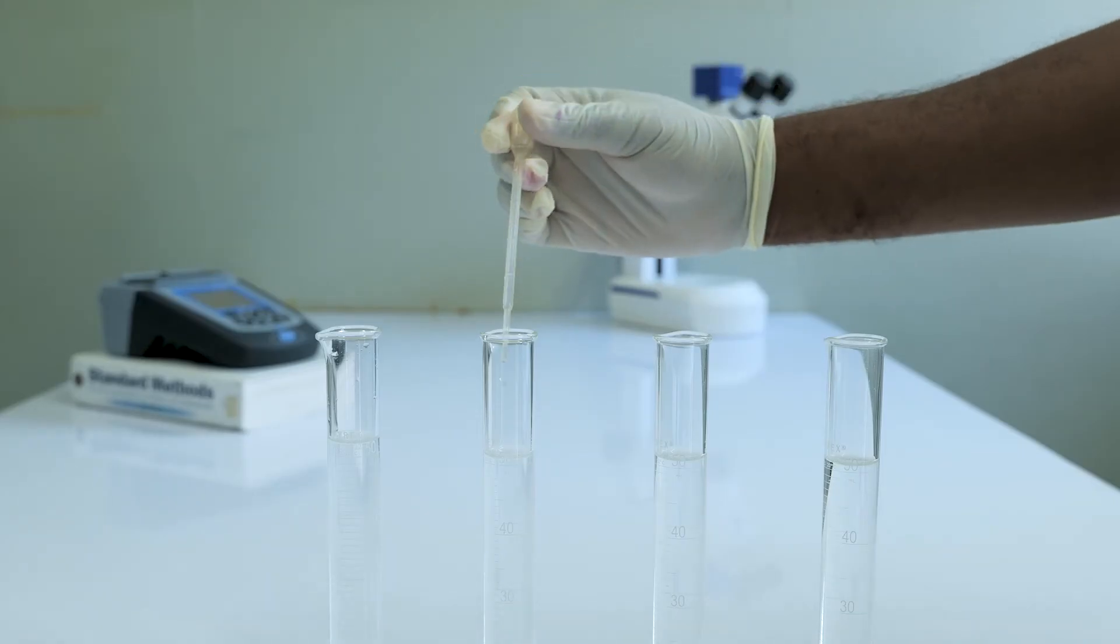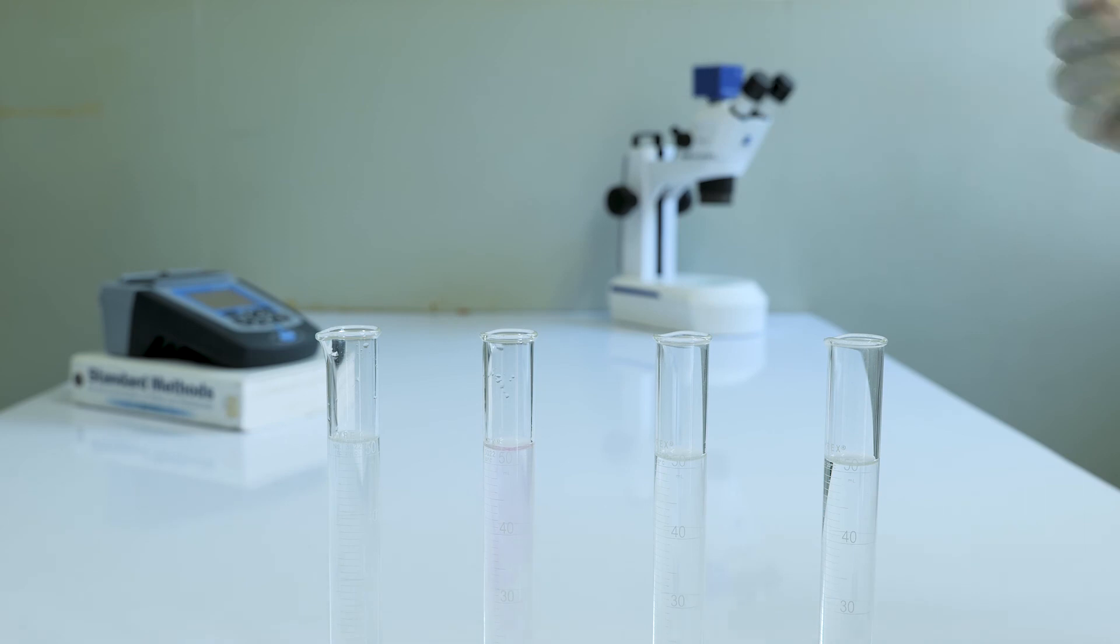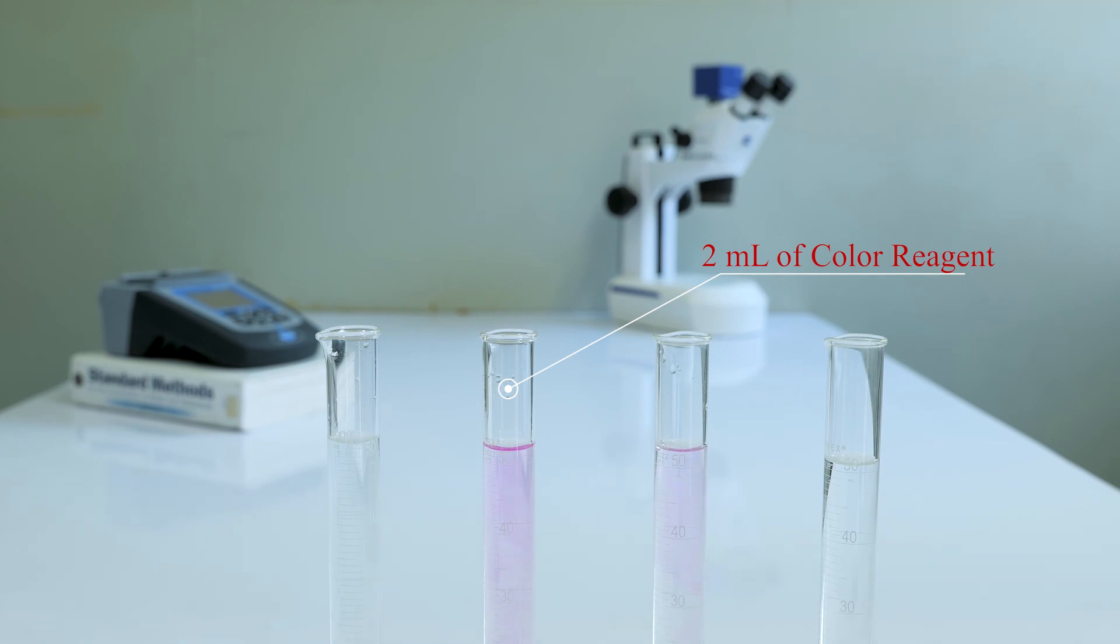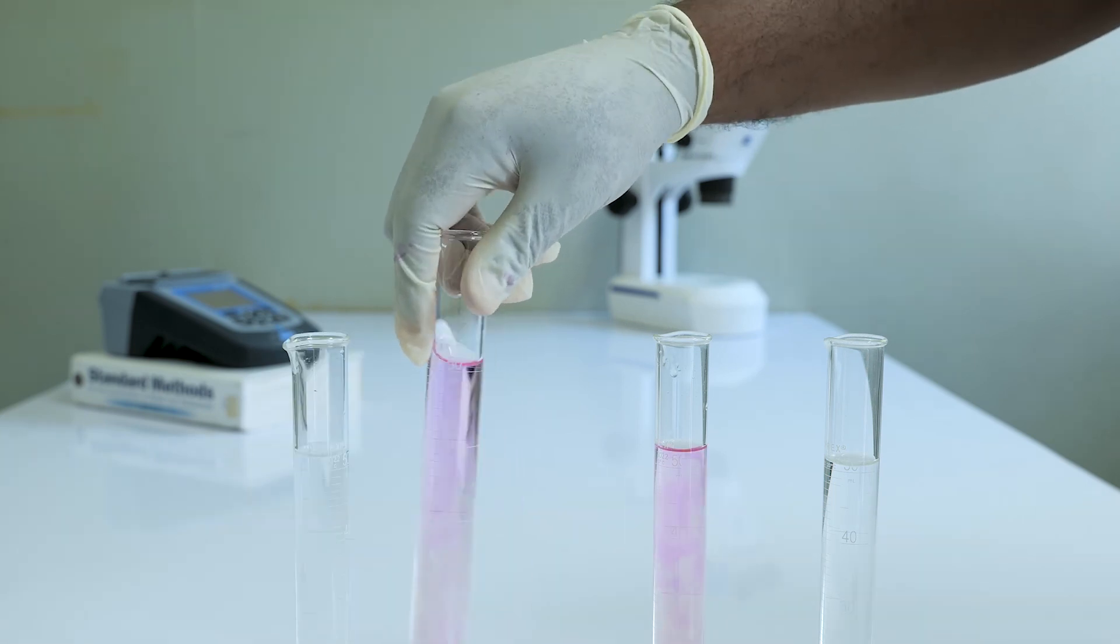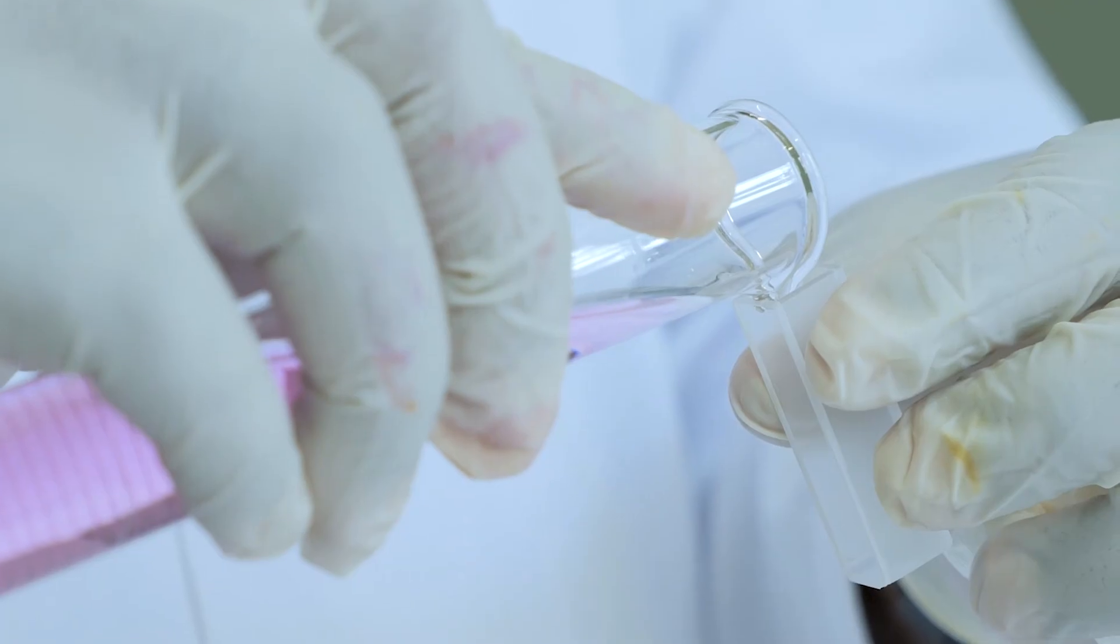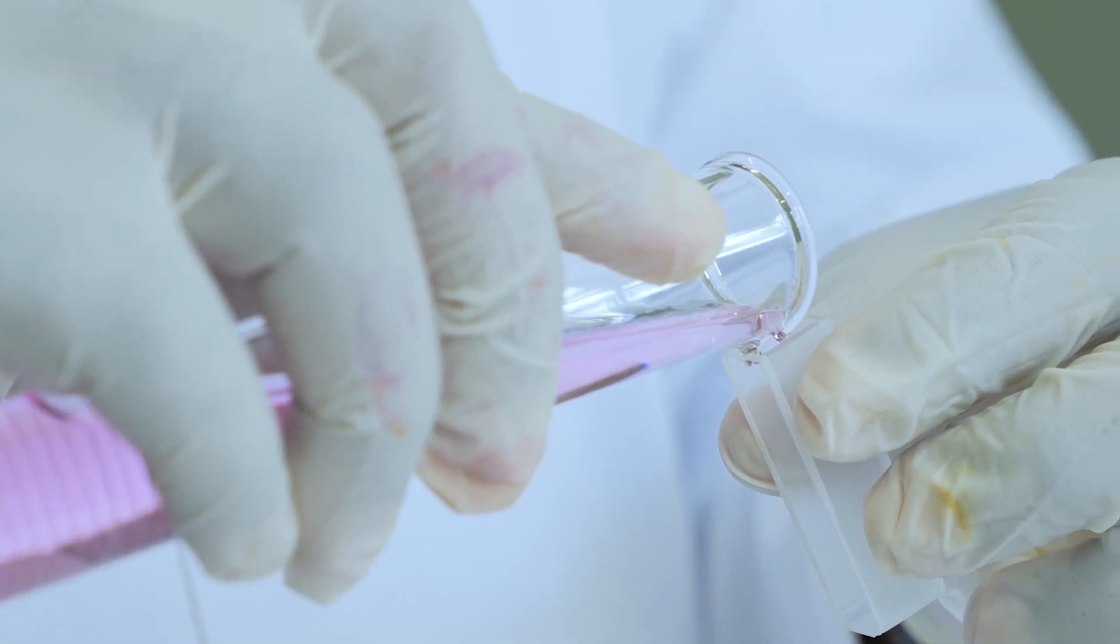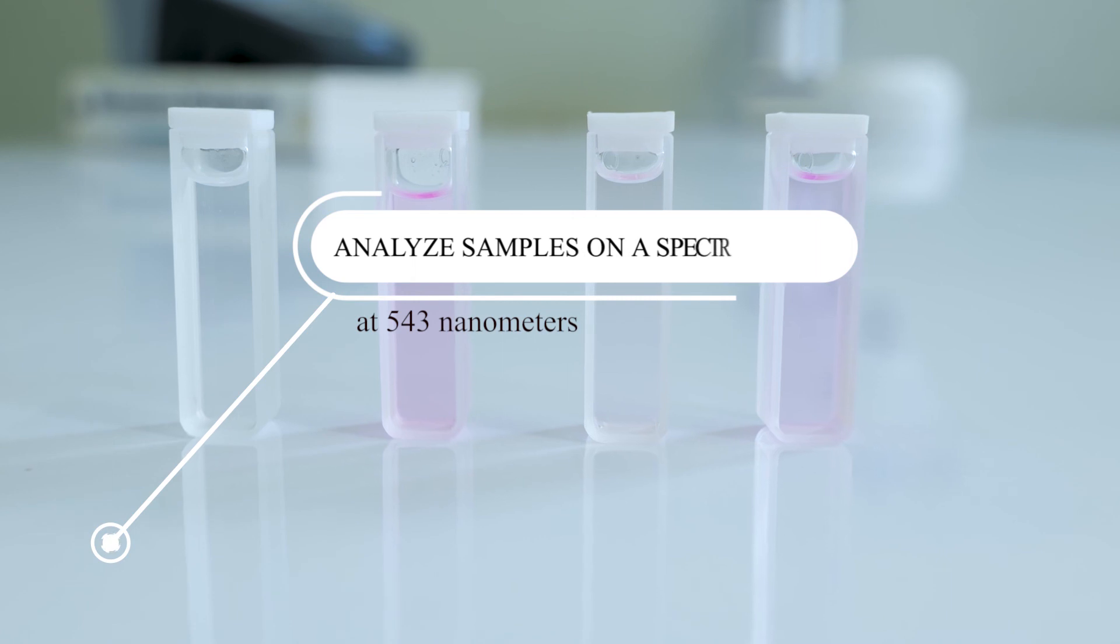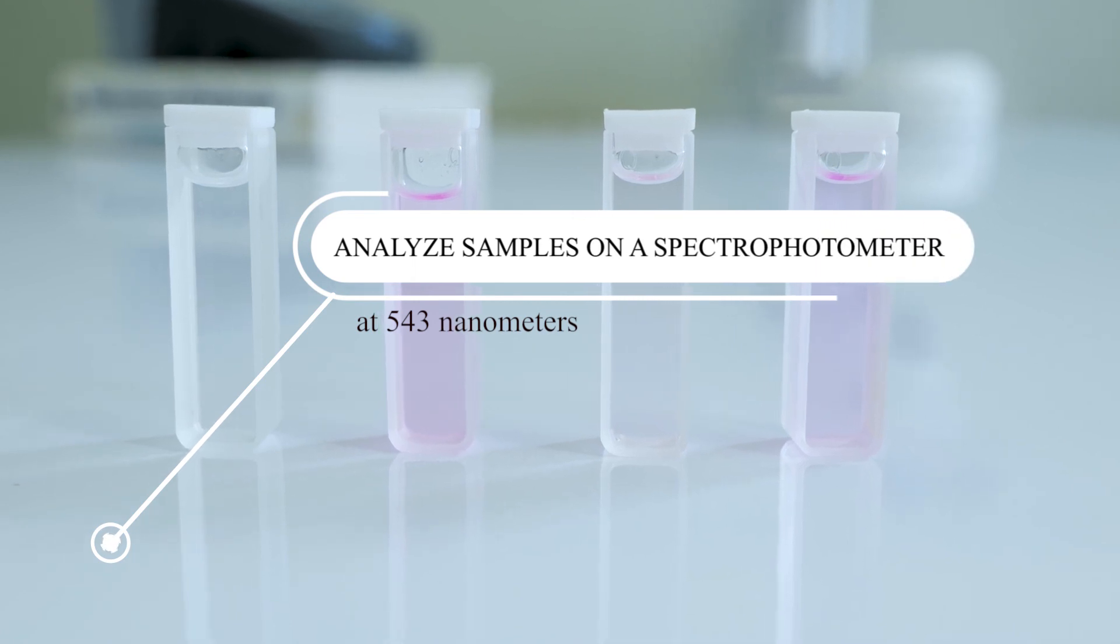As soon as possible and not more than 15 minutes after reduction, add 2 milliliters of color reagent to 50 milliliters of sample and mix. Between 10 minutes and 2 hours afterward, measure absorbance at 543 nanometers against a distilled water reagent blank.